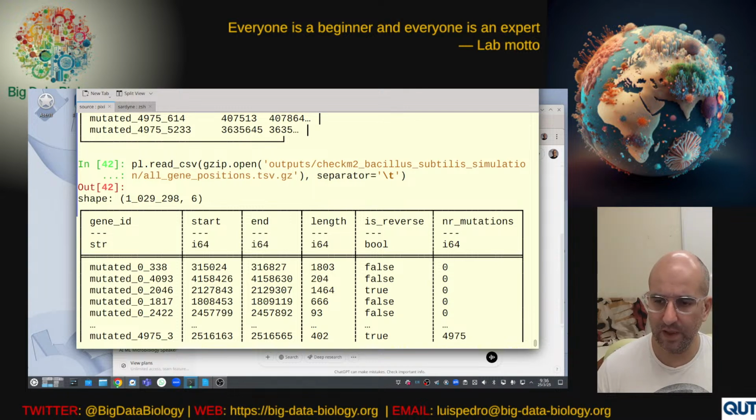If I had a table, basically this gene ID here and then the eggNOG OG, everything would work, right? So this is what I want: this gene ID, eggNOG OG.